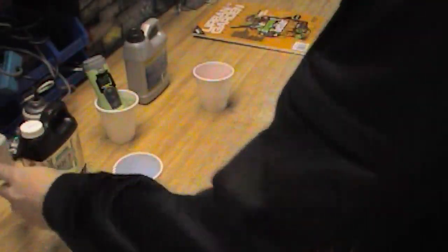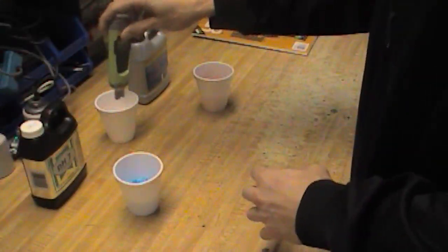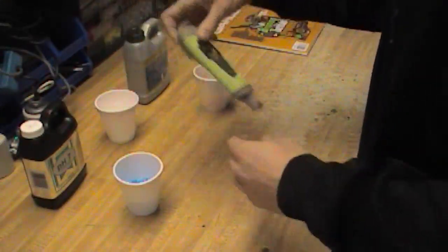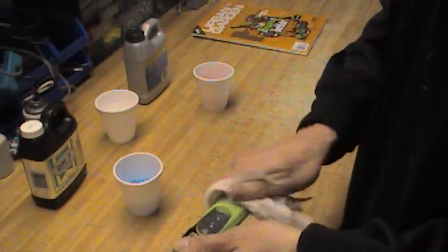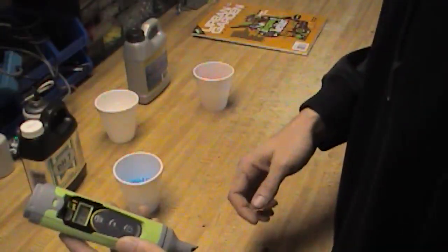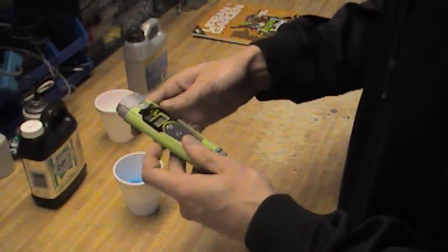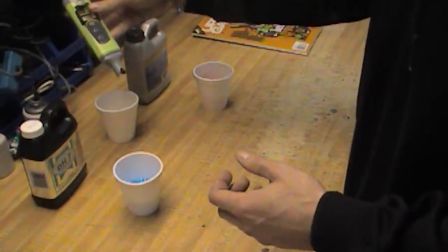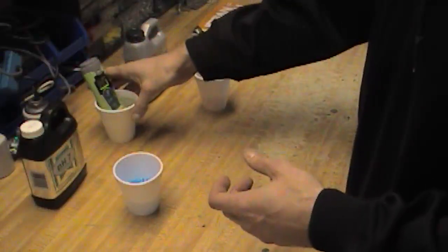All right, nothing tricky about it. Now the Oakton pH basic happens to be a very easy unit to use, comes with batteries straight out of the package. I'm just going to turn it on.